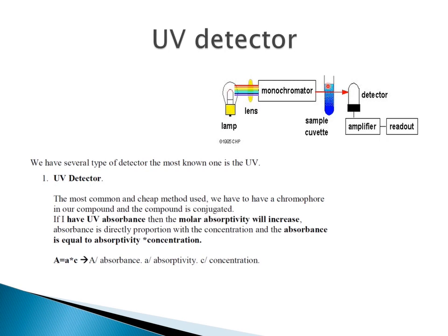If we have light-absorbing analytes, then the beam will be partially absorbed, and the detector can measure the degree of this absorbance by electrical circuits converting the light language to the electricity language. So UV should be reserved for conjugated compounds that contain, for example, benzene or other benzenoid parts.